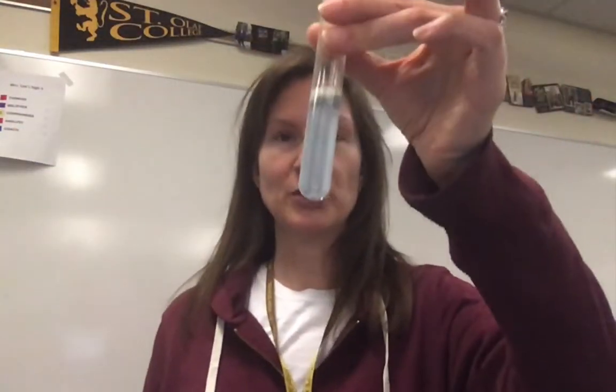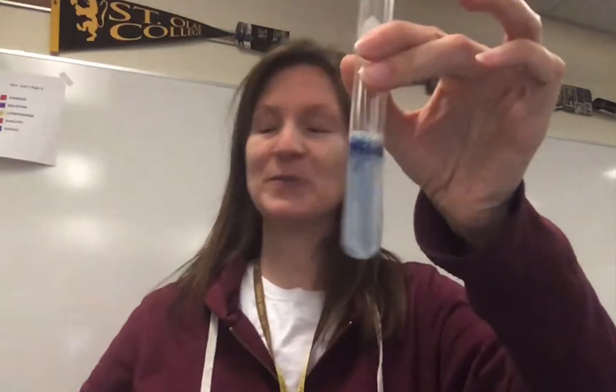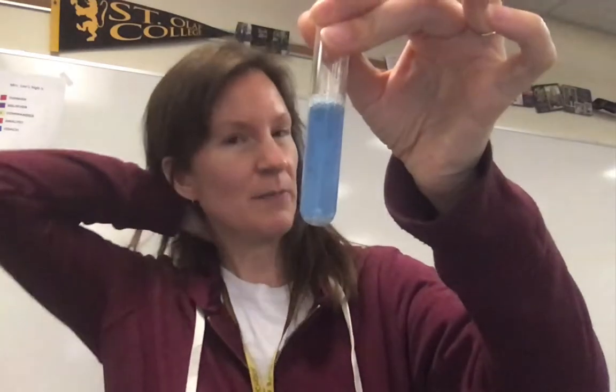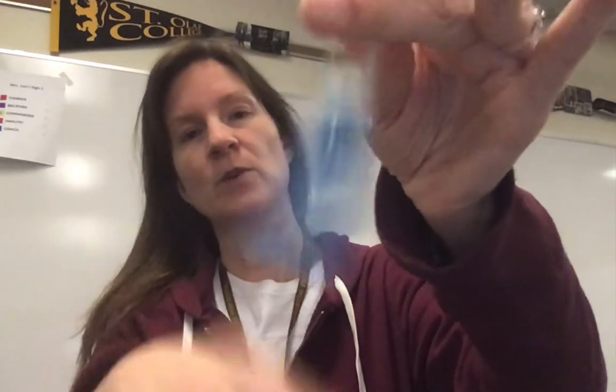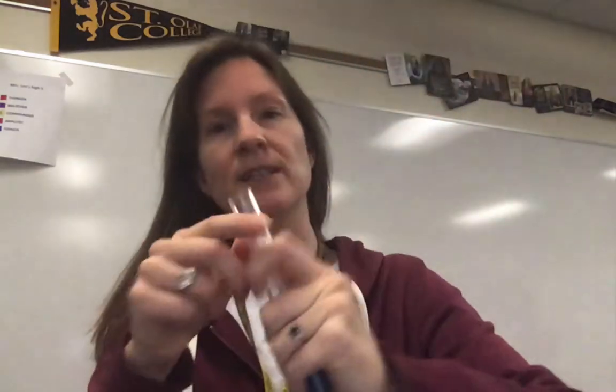Here's test tube number 2, and if we put our couple of drops of bromothymol blue in and mix it, you can make observations about it once the reaction has stopped. So again, you want to be able to determine what is the limiting reactant and what is the excess reactant based on your observations. So what are you seeing here that can tell you what reactant is gone and what reactant is left over? Go ahead and do the rest of the questions.